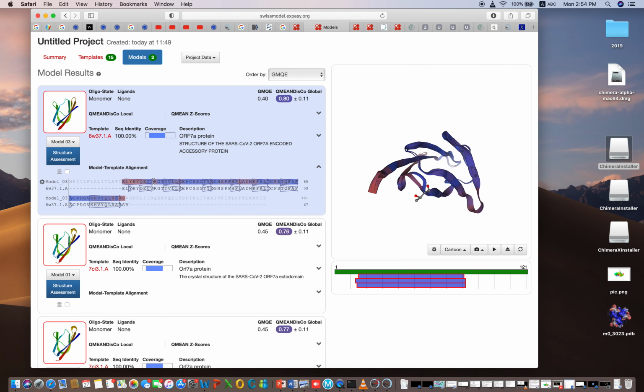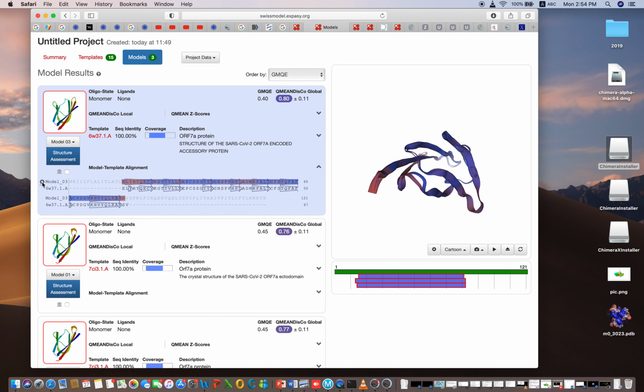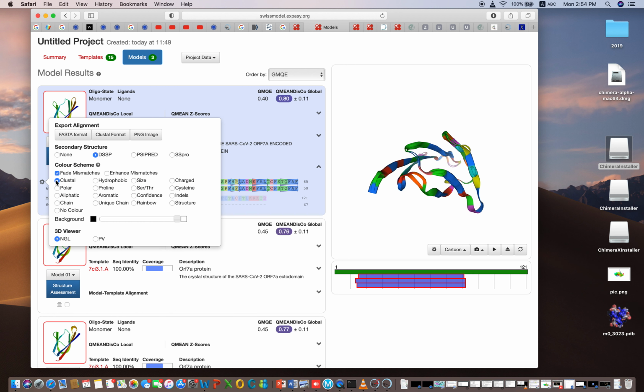Okay, already selected. I'm just going to change this.